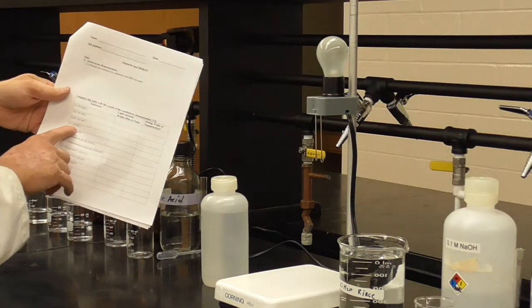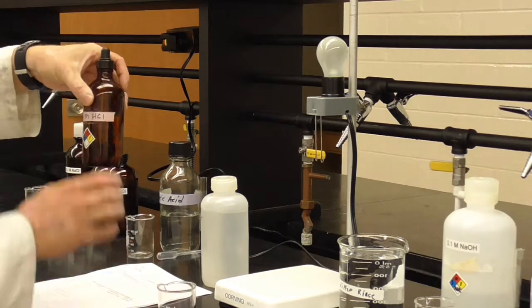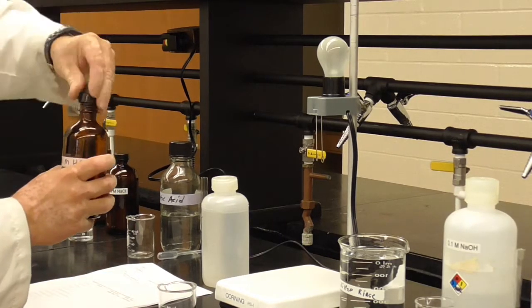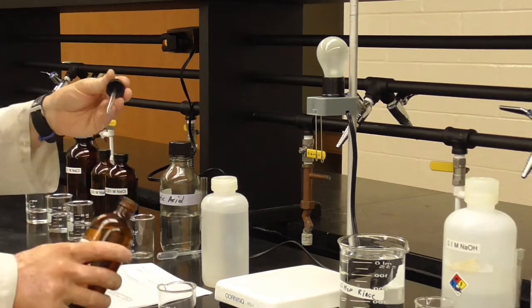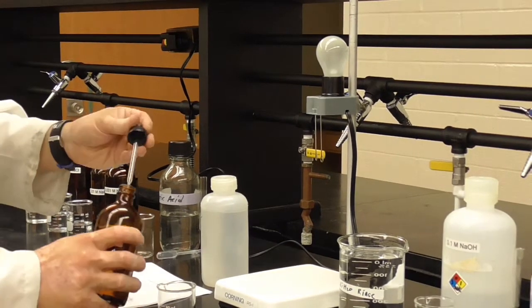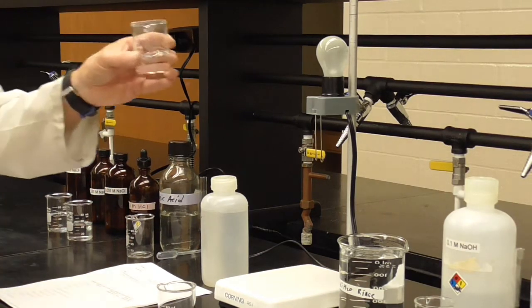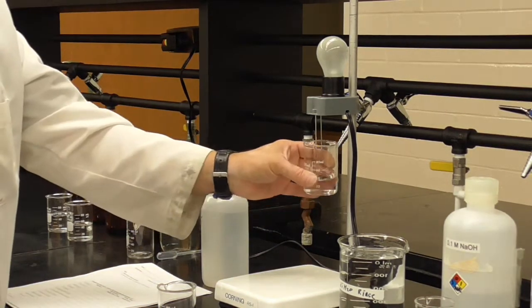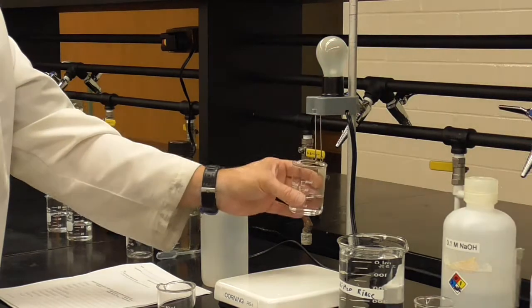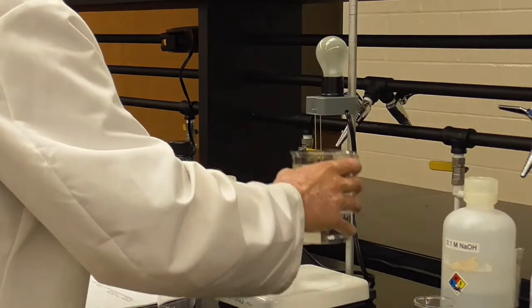So next on our list is 0.1 molar hydrochloric acid. This guy here. What's the difference? We looked before at 0.1 molar sodium chloride, and I would bring that back here just to remind you. The very first solution, 0.1 molar sodium chloride, very bright. Let me rinse that off.